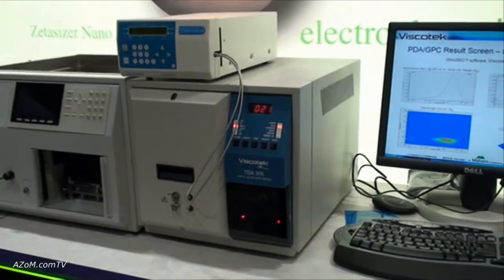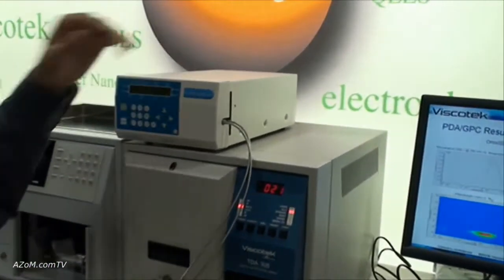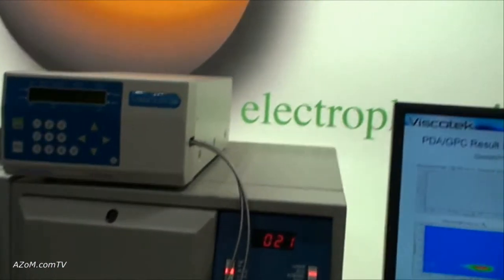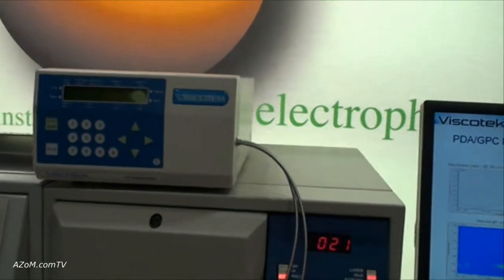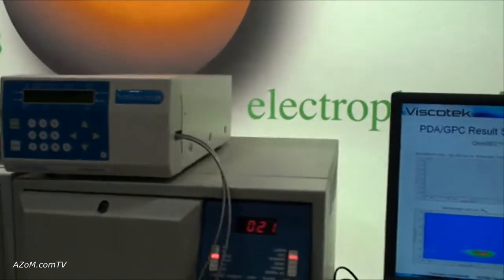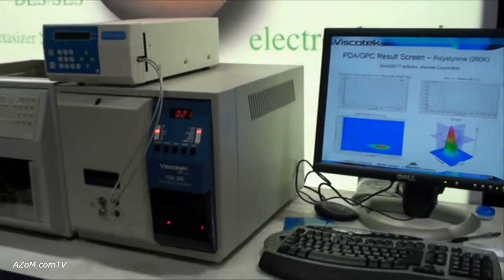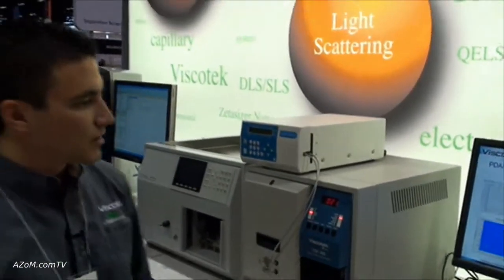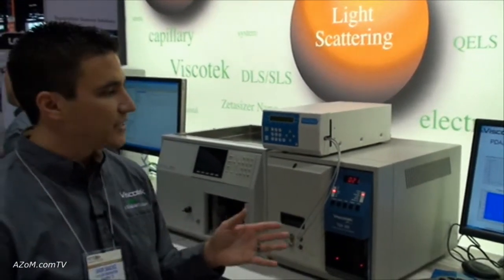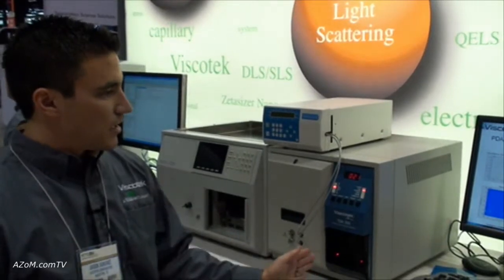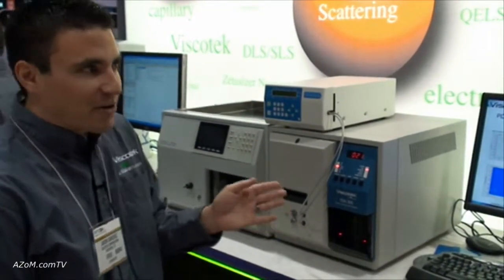The new detector we'll talk about today is the PDA detector. This is the only PDA detector offered for GPC or size exclusion chromatography systems, and it allows you to look at the full range of wavelengths of your sample at each single injection, at each chromatographic point.